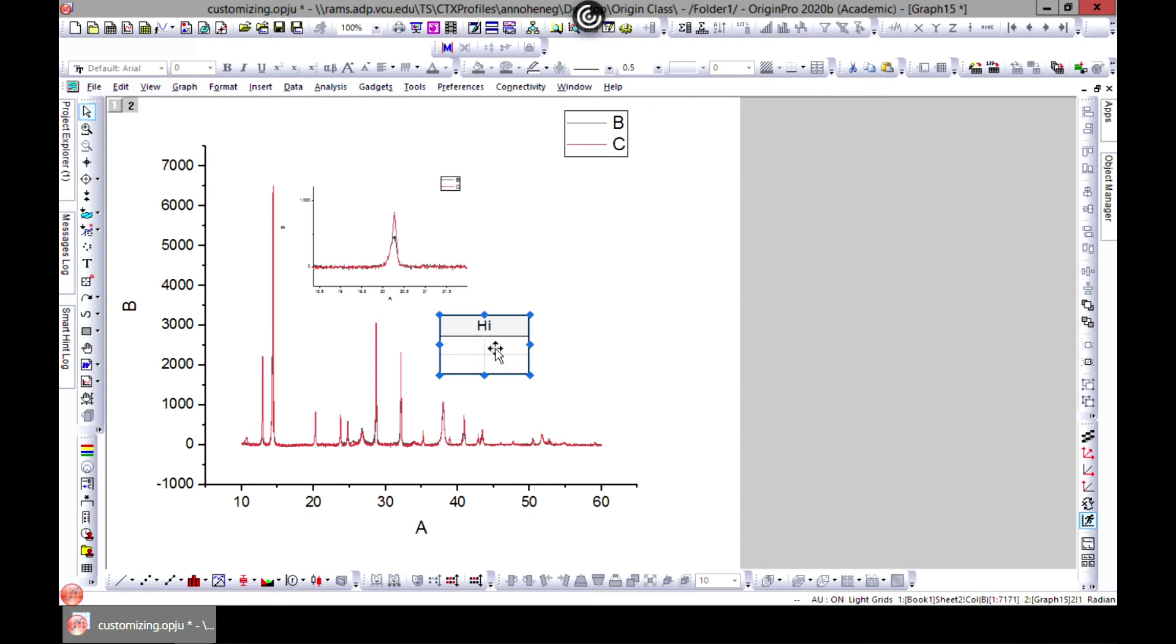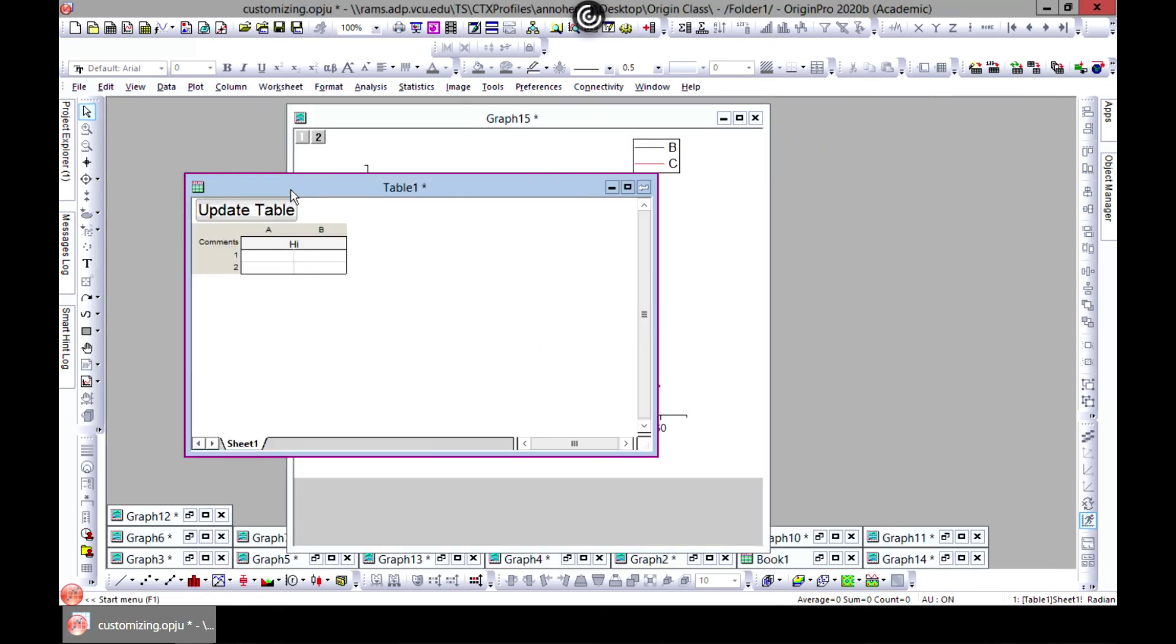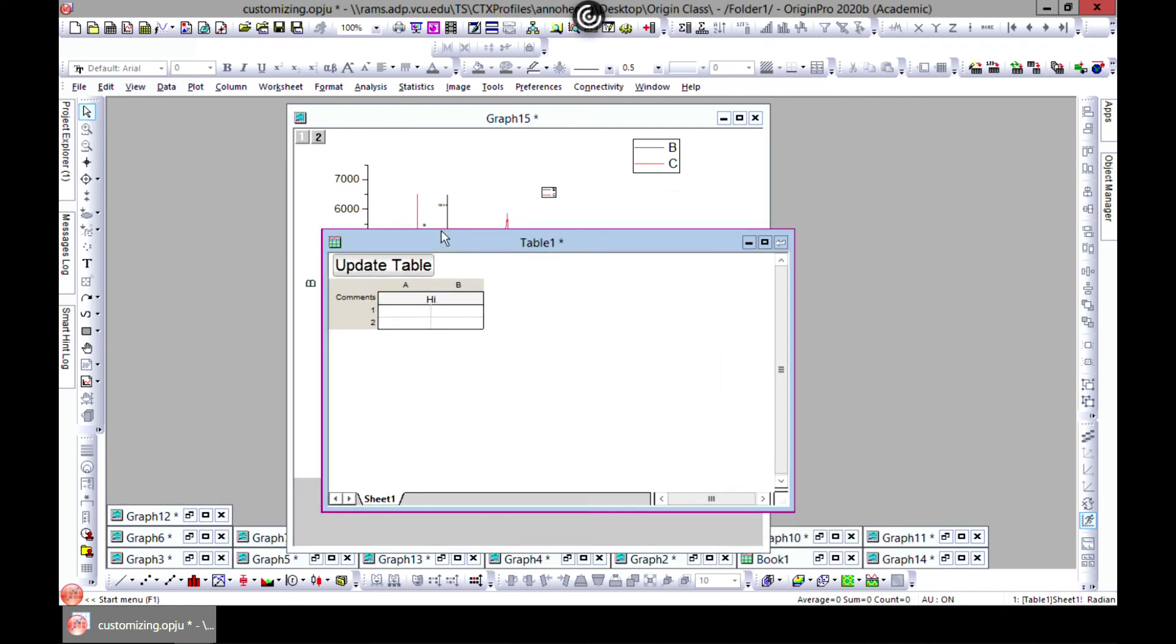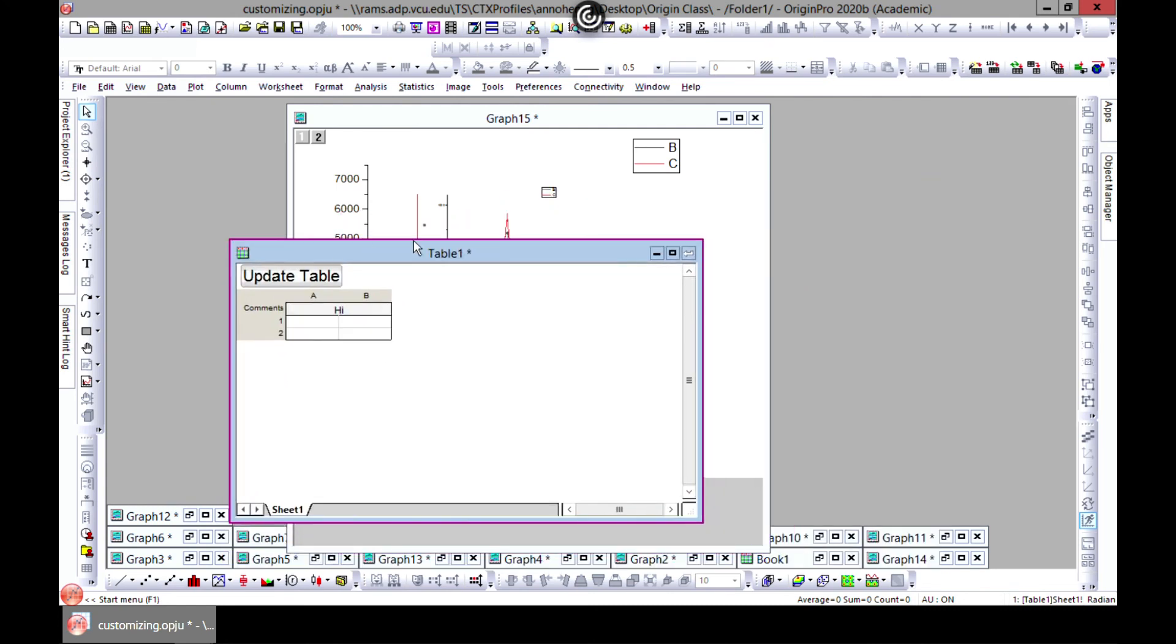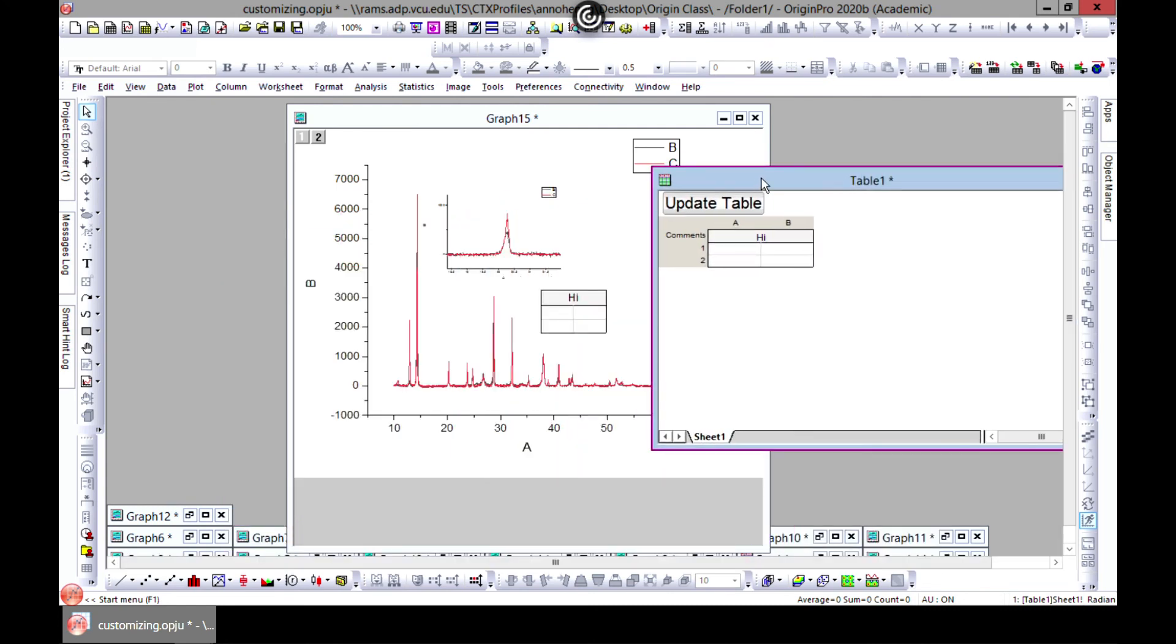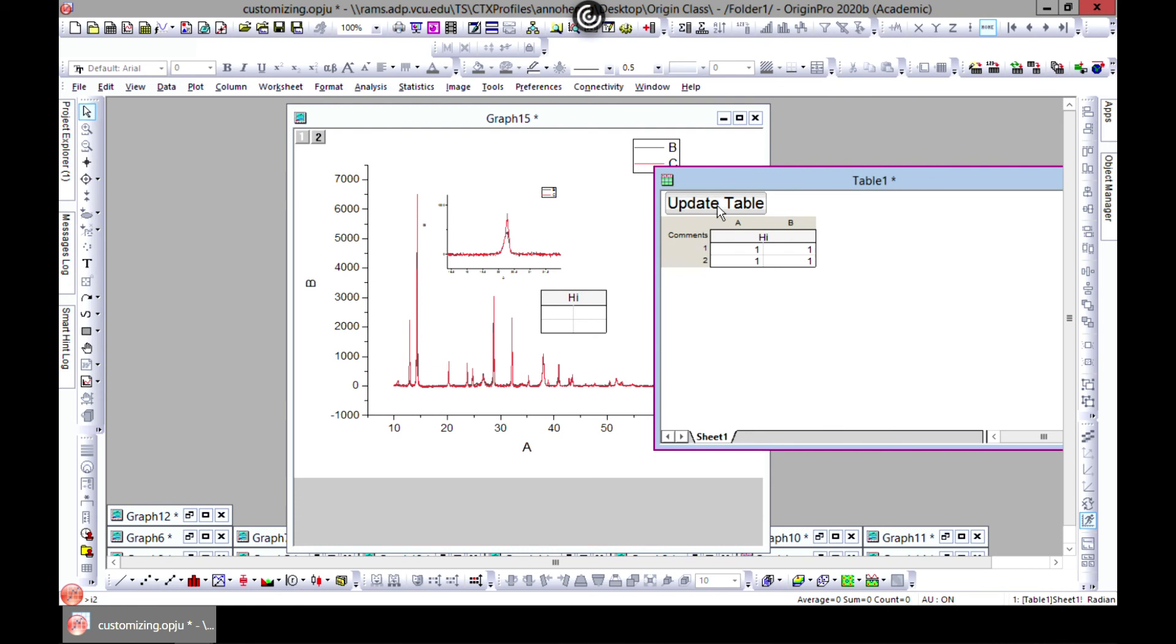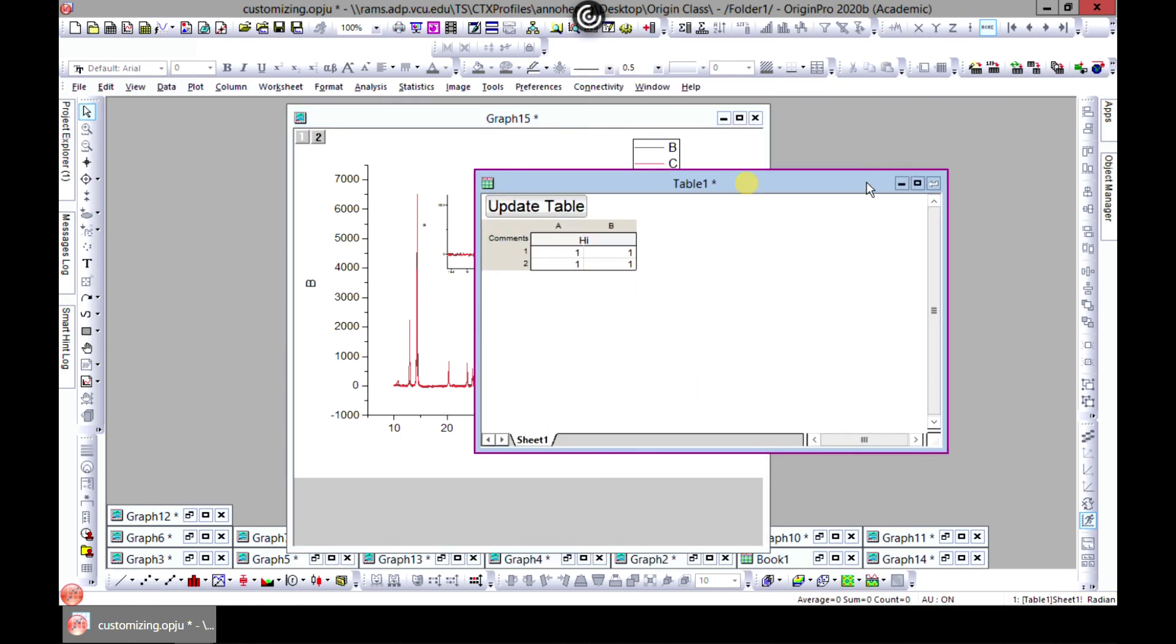You just double-click on it. It brings you to this table window, and let's just say we are going to write '1, 1, 1, 1.' Then you hit Update and it shows in your graph.